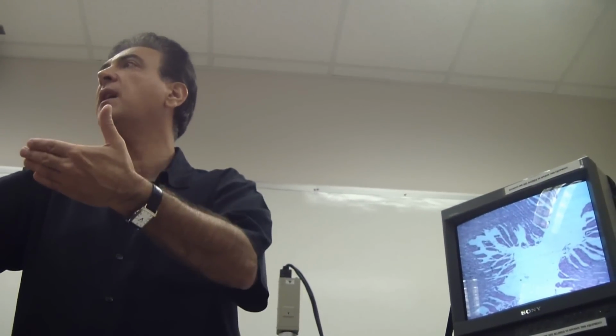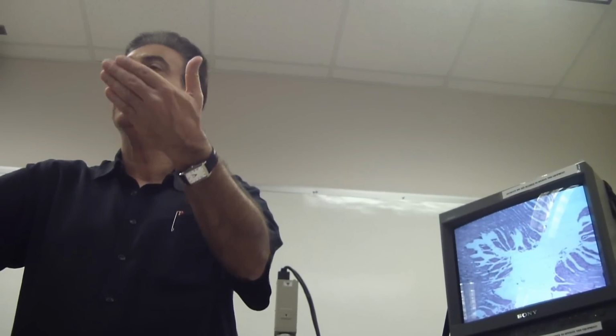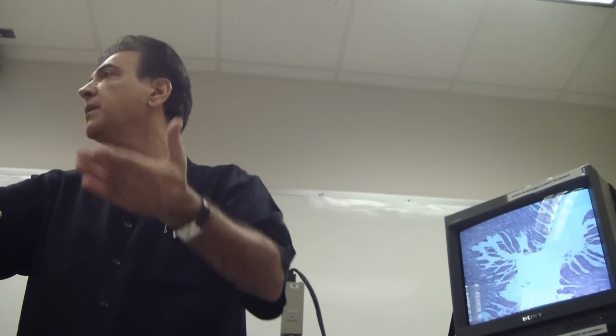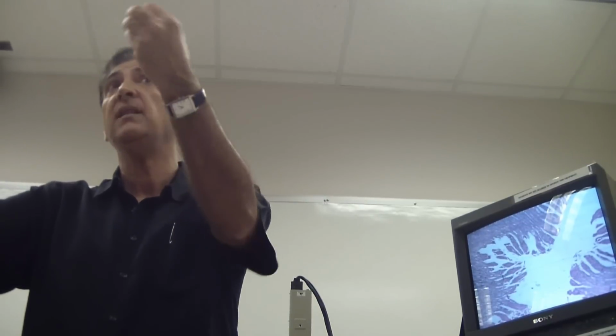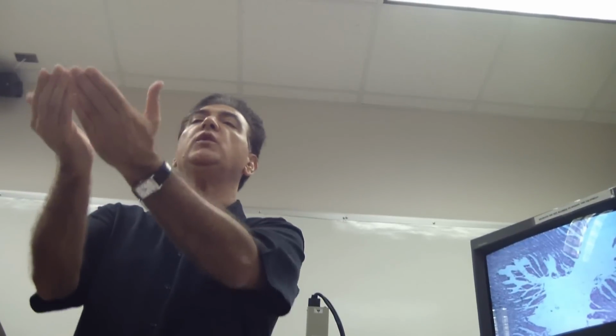Anytime you look at a particular tissue, whenever you do histology, you always have to have a reference picture, unless you already know. Like in my case, I don't have to, because I've been teaching this for over 25 years. I know exactly what Peyer's patches or Brunner's gland look like. But in your case, just in case you do not know, that's the reason I told you to bring your lab book, so you know exactly what Brunner's gland looks like, or what the Peyer's patches look like. So when you see them in here, you can recognize them and say, oh, this is the Peyer's patch, that should be ileum.